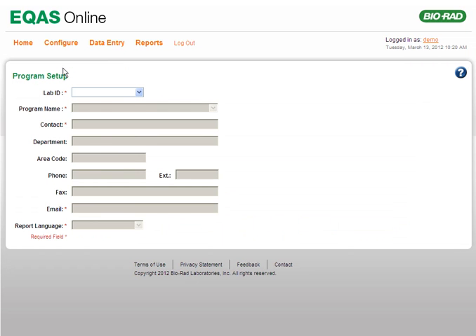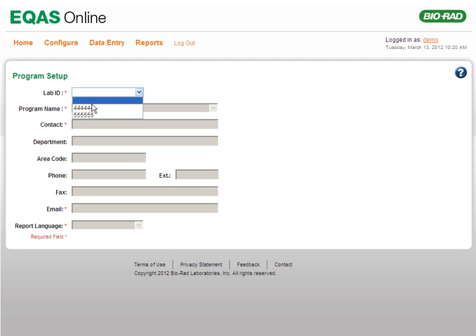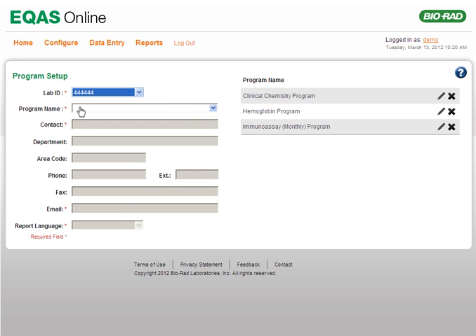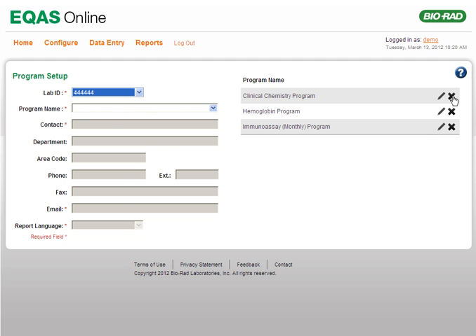On the Program Setup page that opens, select the appropriate lab number from the Lab ID list. The Program Setup page now displays a list of programs the lab is enrolled for. Click the Delete icon corresponding to the program you want to remove.